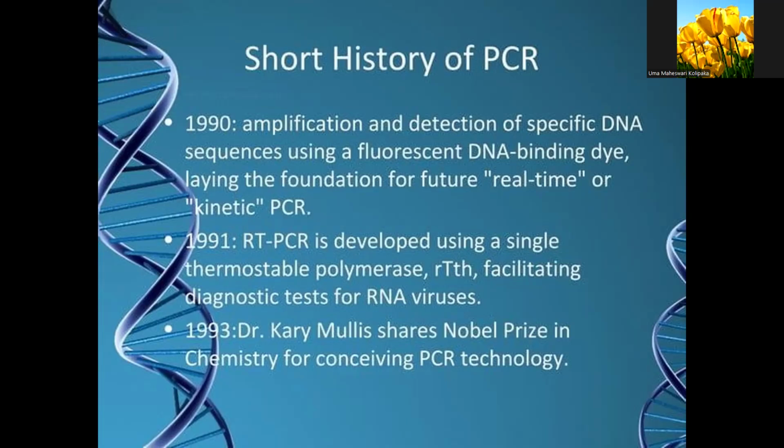Thermostable means it is able to tolerate changes in temperature. Thermostable polymerase rTth facilitates diagnostic tests for RNA viruses. Not only DNA, RNA viruses can also be diagnosed.